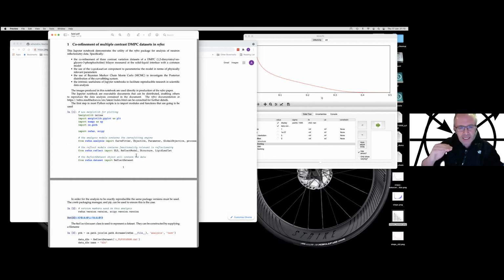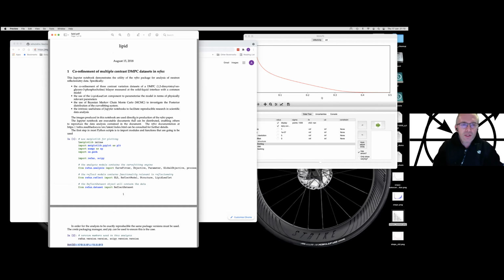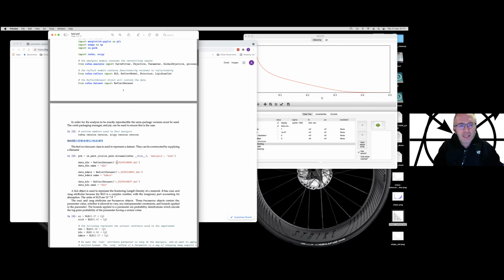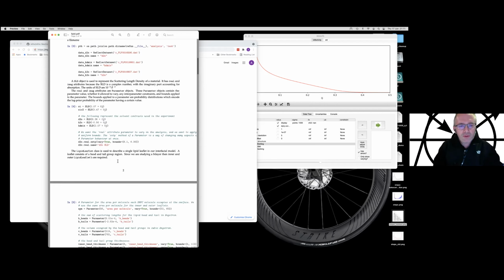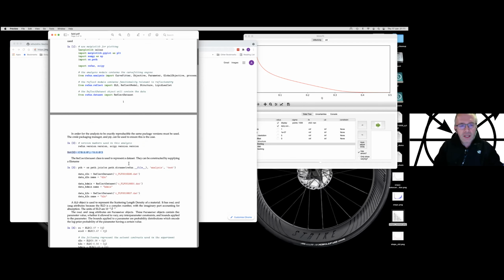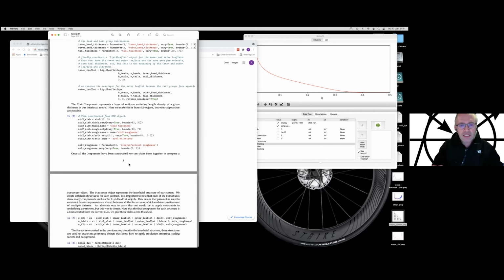They have different cells, and in one cell you might have text, but in the next cell you could have an executable piece of code. The idea behind this is that you can write a notebook, attach it to your supplementary information, and submit that with your paper. Then people who read the paper can go off and reproduce the data analysis that you did.